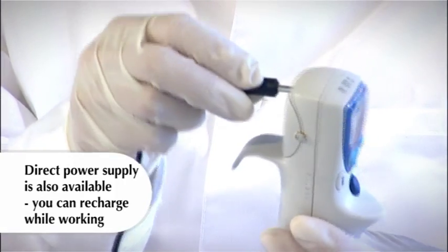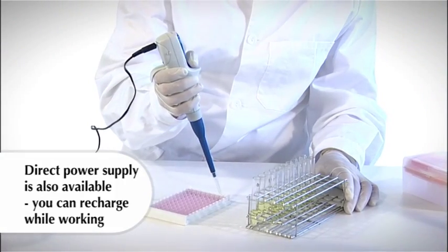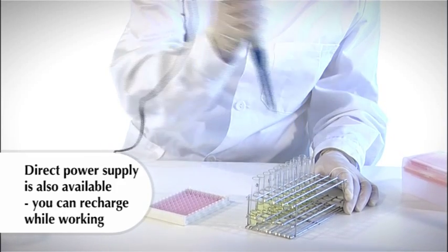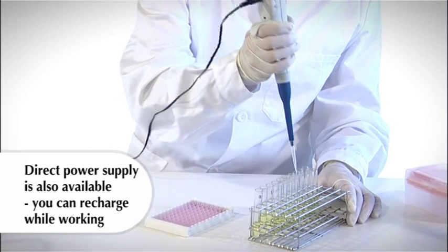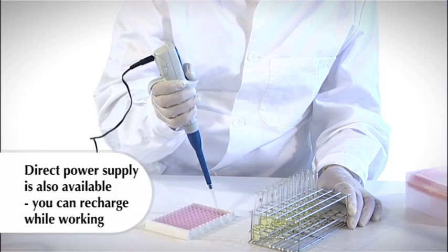You can charge the battery of the E-Line by using a direct power supply with the AC adapter. When using the adapter, you may continue your work even if the battery is getting low, as it recharges the battery at the same time. E-Line will also give you a sign when the battery is low and you need to recharge it.